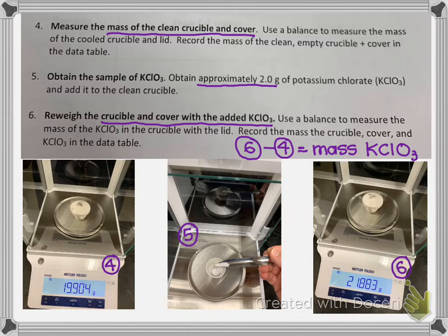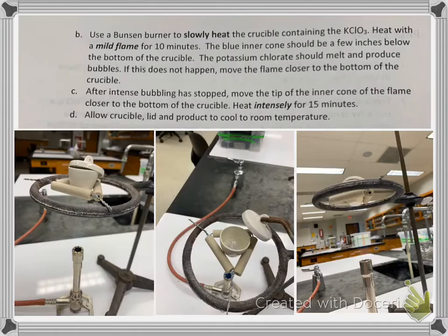That is a spot where the mass of the potassium chlorate is not under, it's under the second part of data. It's under calculated data. So read carefully your data sheet. Now I then set it up, and there was a step here on the bottom if you're following along in the procedure, which I encourage you to do. Letter A had me setting it all up and setting the lid ajar, but it wouldn't fit very well here.